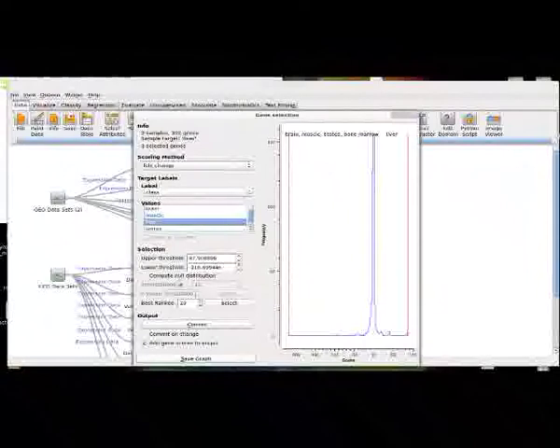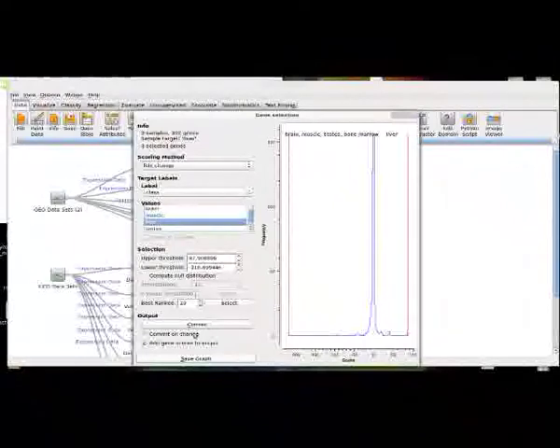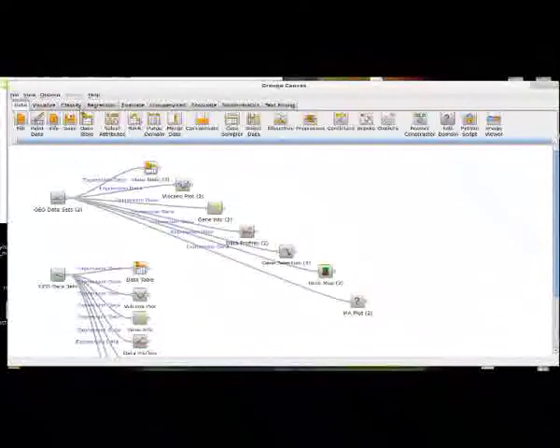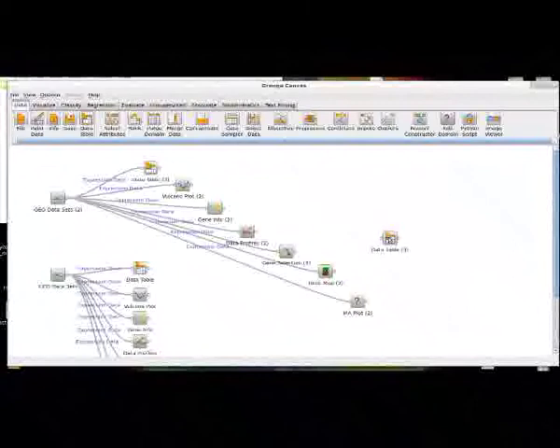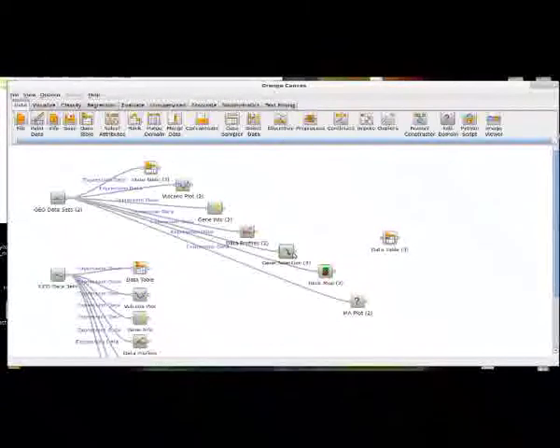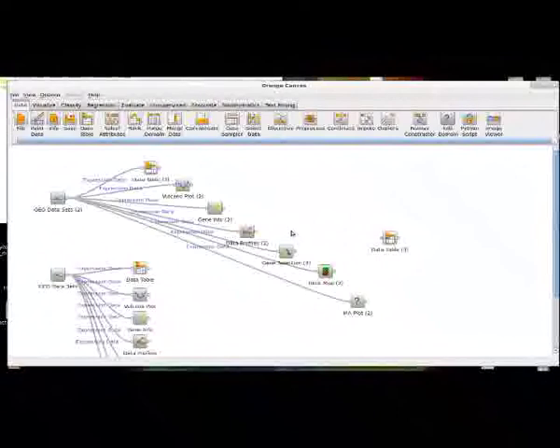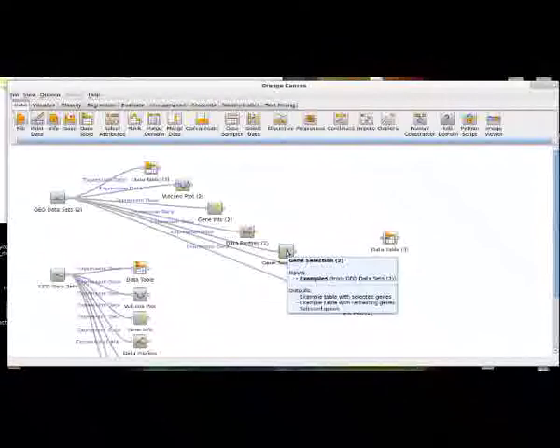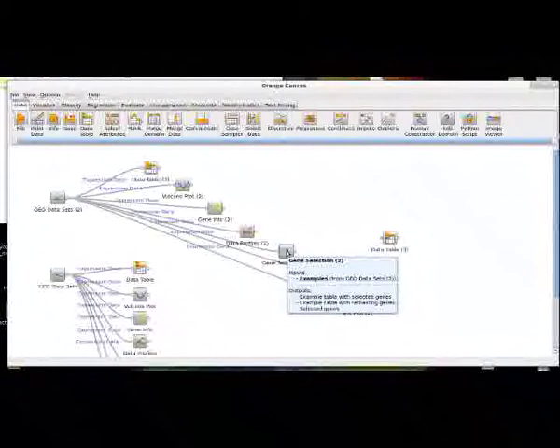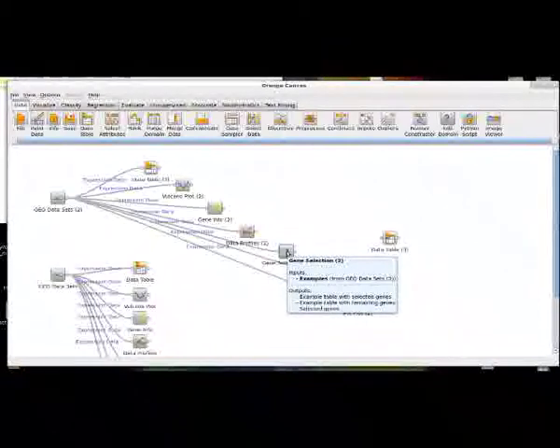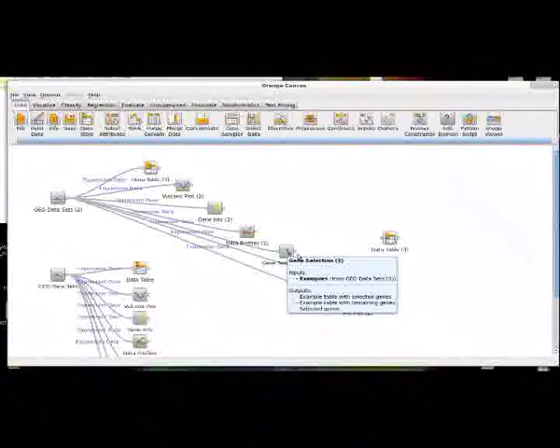But when I select, let's say, the liver values, and I hit commit, I'm going to output this to a data table, because when I'm committing something, I'm saying this widget, whether it takes input or not, is going to output something to another widget. If I mouse over it, it says that this widget outputs to an example table with selected genes.